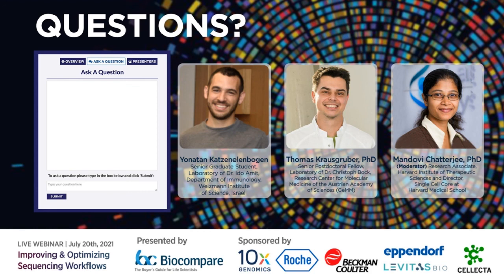Especially, I can talk about single cell with more confidence than I can talk about the bulk experiments. So in my experience, people always rush to their experiment, which often leads to disaster. It is important, since these are very high financial undertakings for any lab, to do your due diligence in optimizing the protocol.